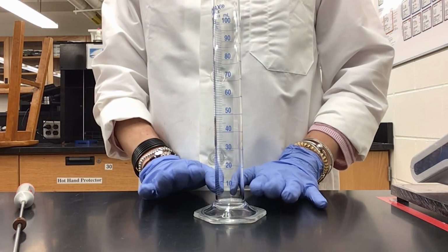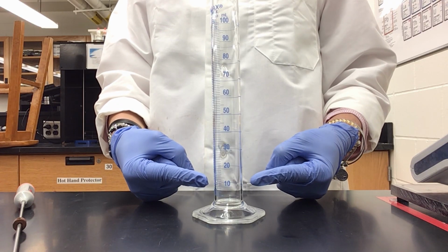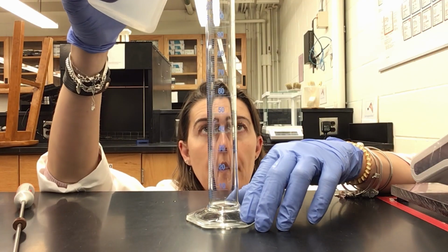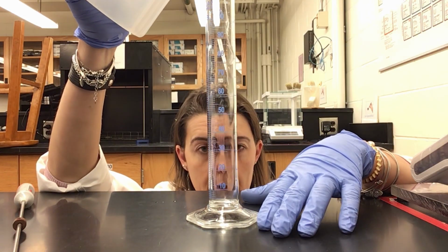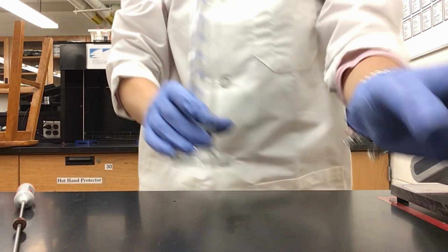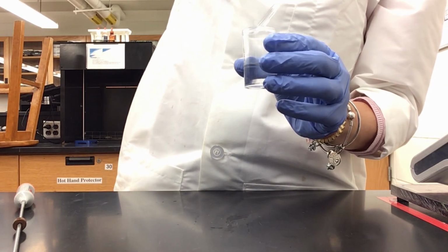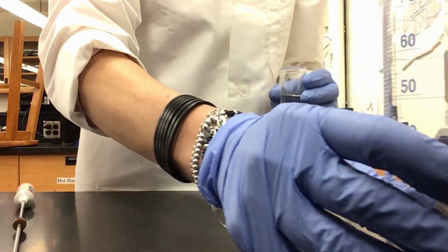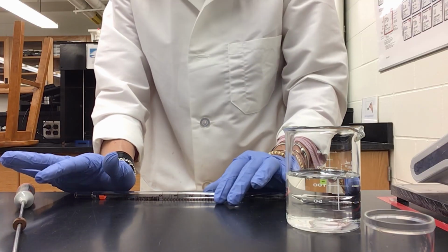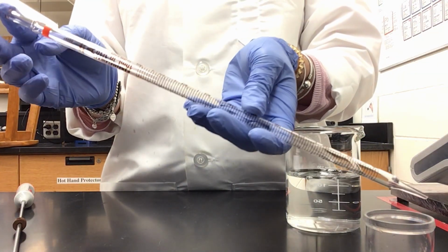So now we are going to test the 100 milliliter graduated cylinder. As you can see, the 10 milliliter marking is right here. So I am gonna kneel again, and I am going to measure 10 milliliters. Okay, I'm almost there. Okay, there we go. I am gonna transfer these. Now that I measured 10 milliliters of water with the 100 milliliter graduated cylinder, I am gonna repeat the 3 measures using this time the 10 ml graduated pipette.